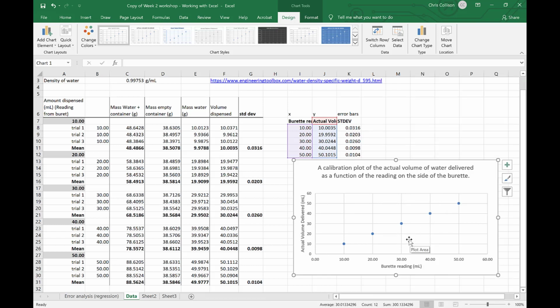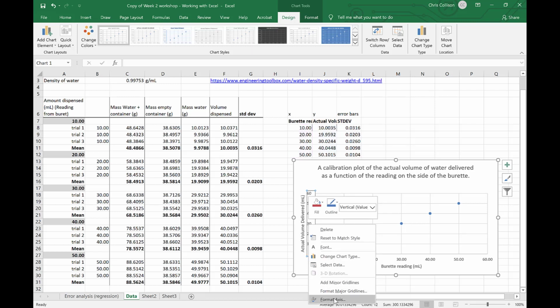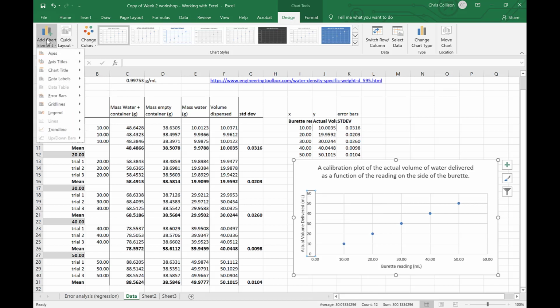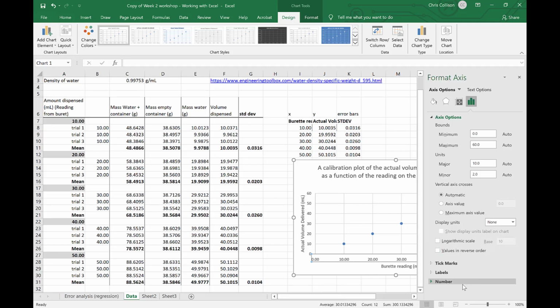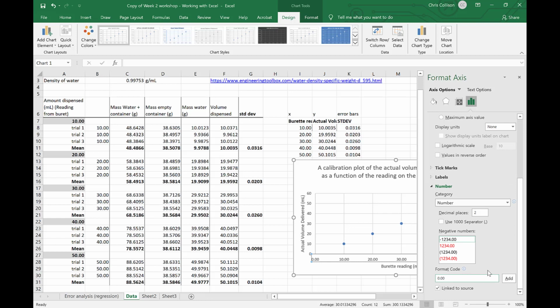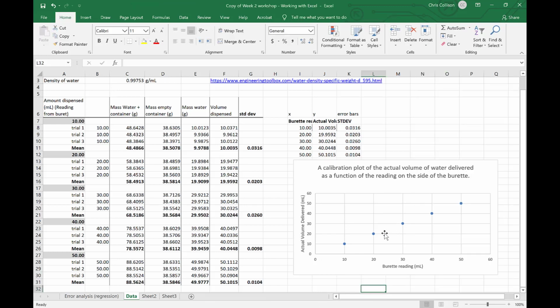If you need to do something in Excel, it will be there. Sometimes the challenge is finding it. So sometimes we need to right click on a particular chart element, and we can format it through the window that pops up. The other thing we can do is, of course, as I mentioned before, use our friends up here on the left hand side, add chart element box. So we'll keep things consistent. We'll reduce this to 0. And this is just the labels that we're using. So it has no impact on the numbers that we're providing. It's just the labels themselves.